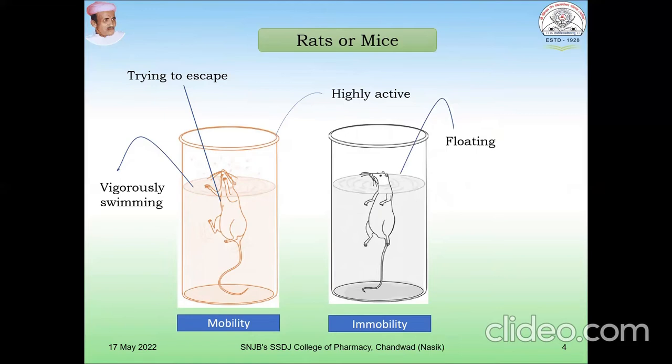This is the posture where the animals are immobile. The nose is just uplifted and the animal is floating. At this time, 80% of the time spent by the animal is in this state. It is called immobility, and one has to consider this immobility timing in the animal.